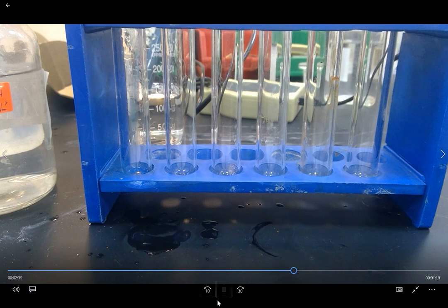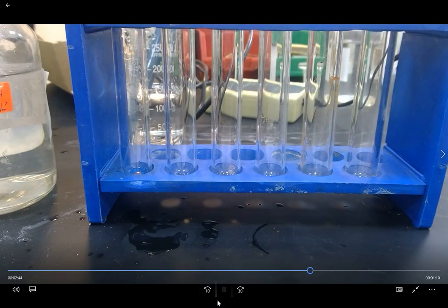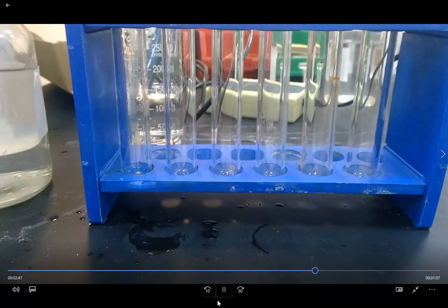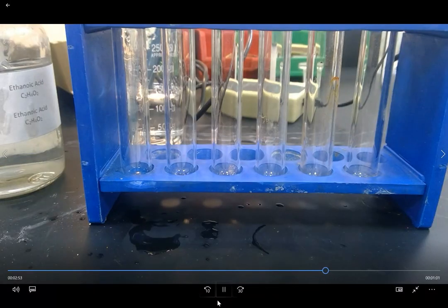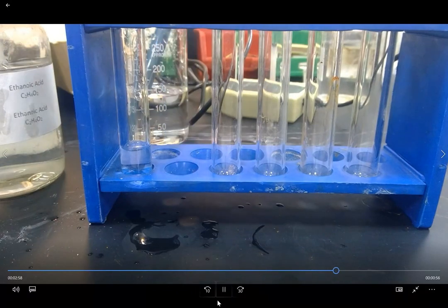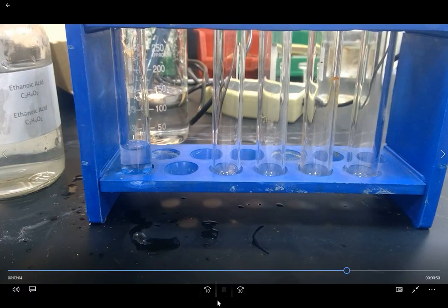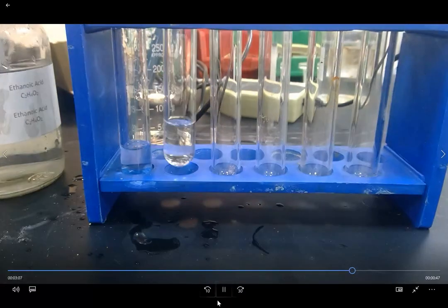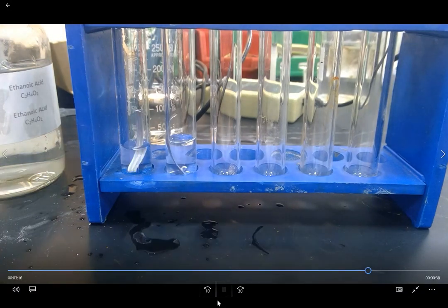Okay, so the first test that I'm going to do is react both of my acids with magnesium ribbon. I'm going to start with hydrochloric acid and then ethanoic. Approximately equal volumes of acid, and I'm going to add a piece of magnesium ribbon to each one.